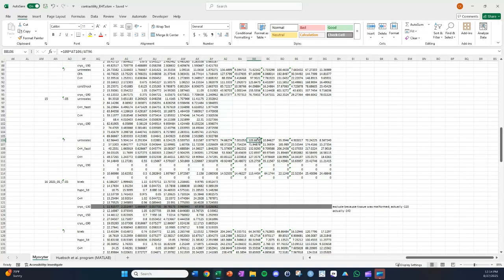And this is a related metric, which is the time between contraction and relaxation. That tends to lengthen by about 25%. So it's slower in this way, and correspondingly slower in terms of transitioning from the contraction to relaxation. So a 25% higher value for the untreated control is pretty expected there. And then typically we see these speeds pick up by about 25%, so maybe 125%-ish. So stronger beating is what I would expect from the untreated control as it's left to age.